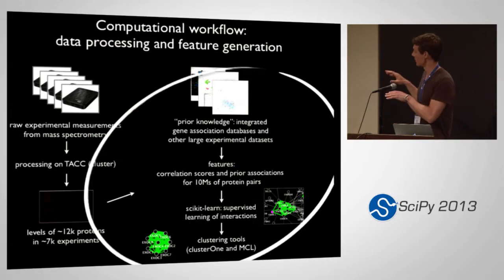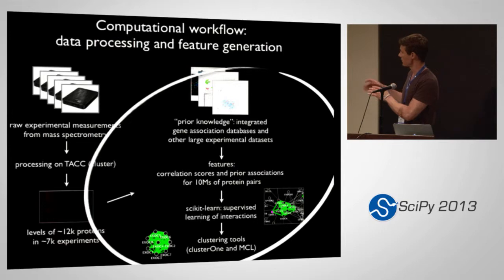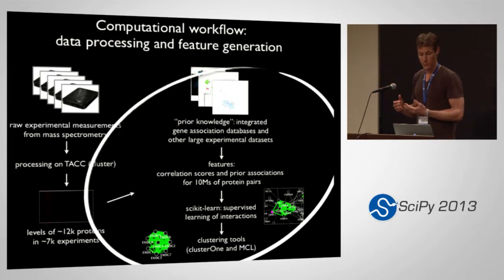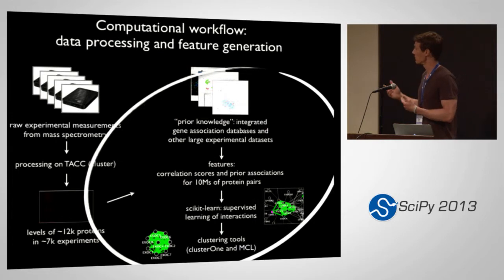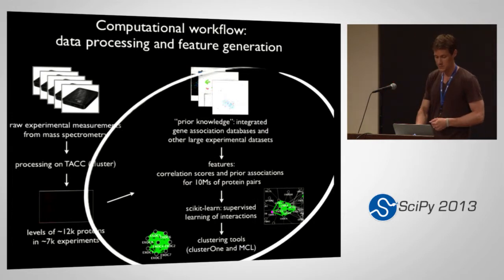And the nice thing about all of these modules that exist in Python, especially the machine learning modules in scikit-learn, is that all of the most changing and most iteratively developing parts of the process I can manage all within Python, and it's extremely nice, and this makes this an actually manageable problem to do on these biology data sets, whereas people who are trying to do this using a bunch of disjoint methods, I think would have trouble managing this much data and putting all this together.